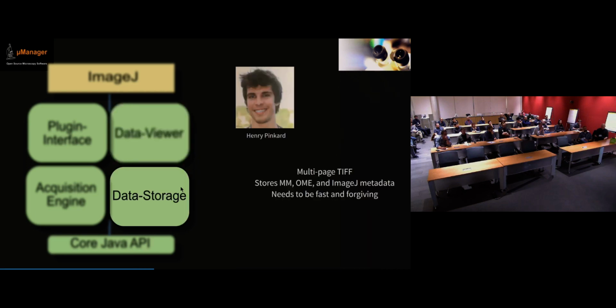The data storage is a bit of a similar idea. I remember that Nenad and I talked to the OME-TIFF people, and we were asking, where's a library that we can just use to start writing files? And then there was no library, and we were kind of just on our own.